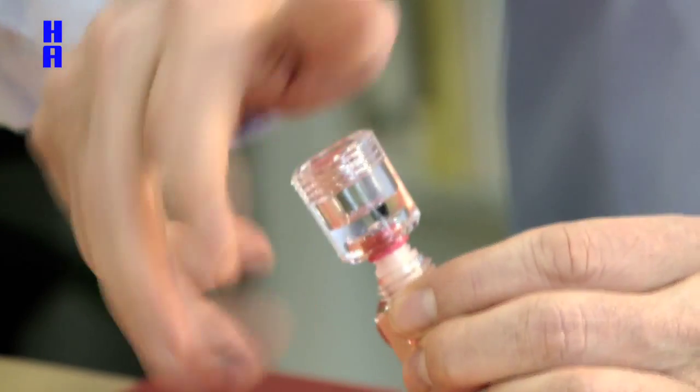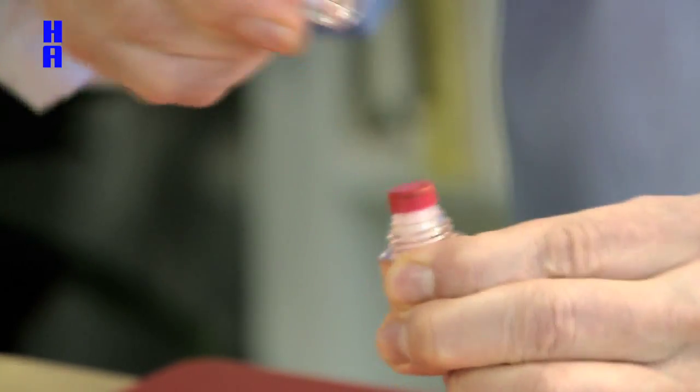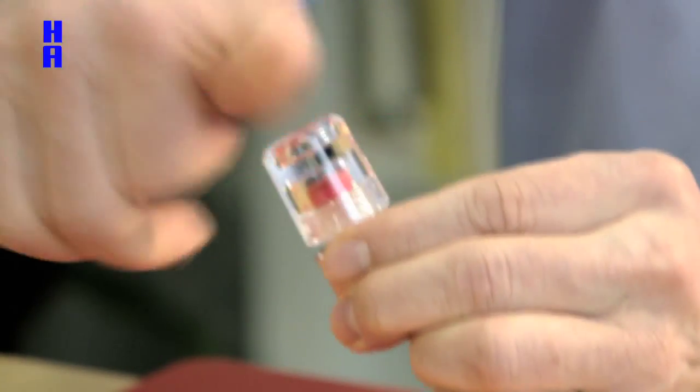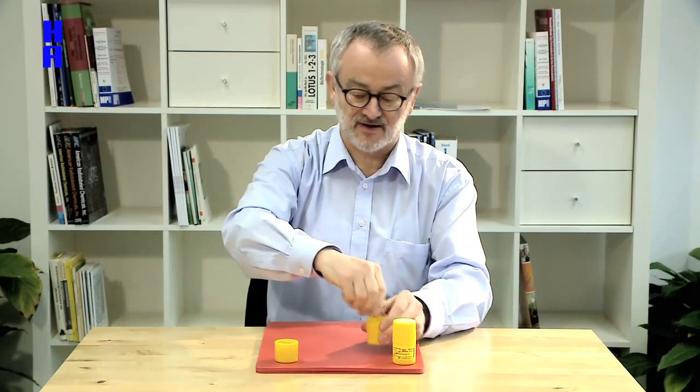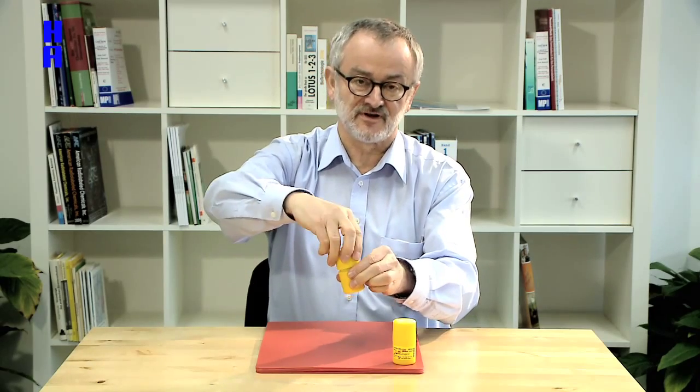put the cap back again, turn around, bend the plexi vial away, screw it back again, put it back again and close the yellow vial.